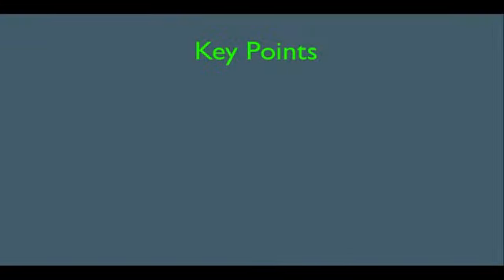In this online lecture, I'm going to introduce you to the mass spec machine. We're going to talk about how it works and roughly how to read the data. And what are our key points here?